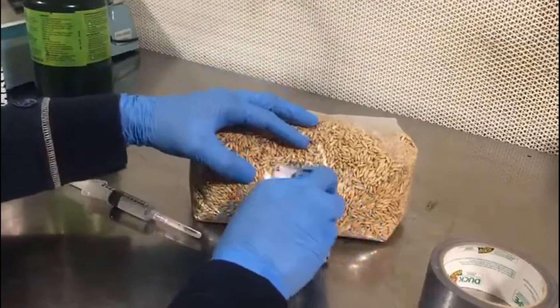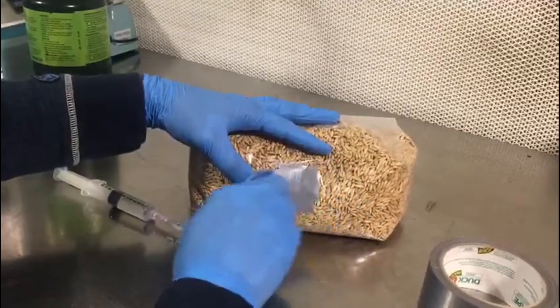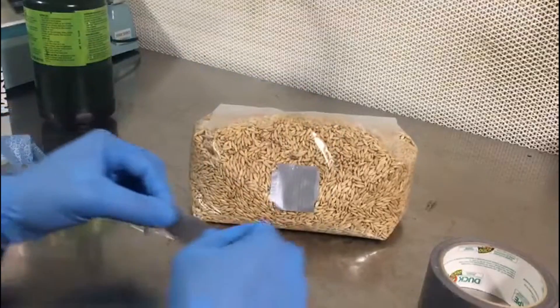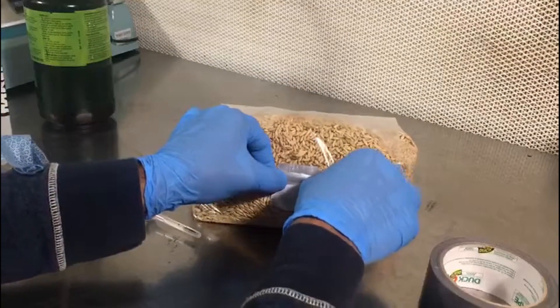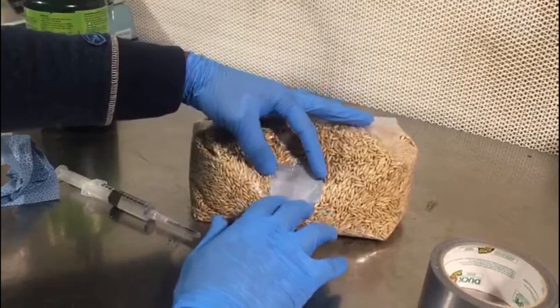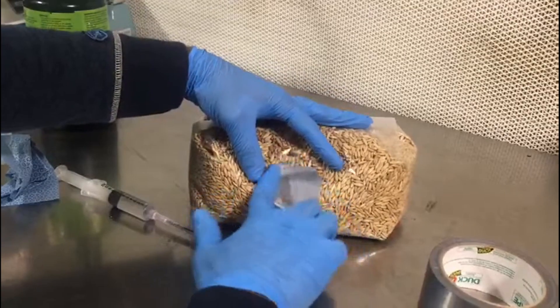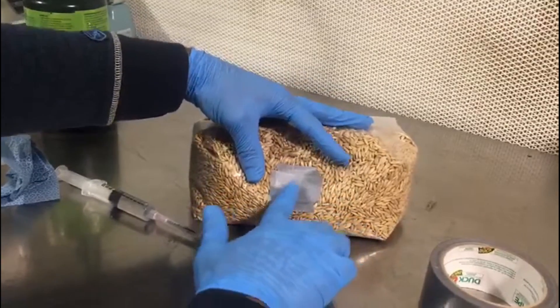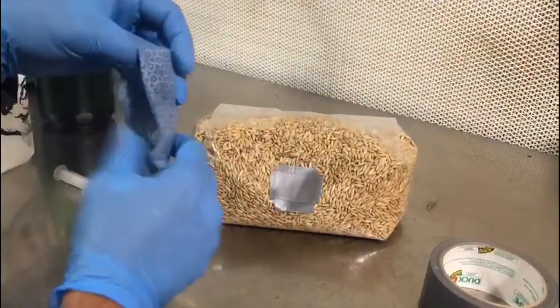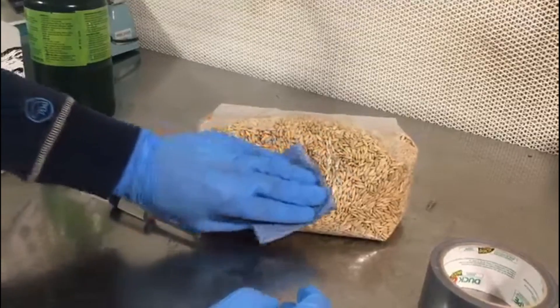We're going to wipe down a second time. Once we have the three layers of duct tape, we are going to get ready to flame sterilize our needle to proceed to inject the media into the bag. Also wipe down the third layer to make sure that nothing can contaminate your sterile grains inside of the bag.